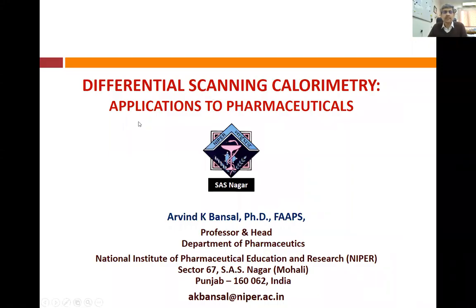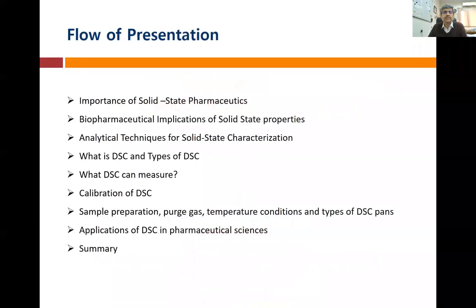Hello everyone. Today I am going to talk to you about a very important technique for solid state characterization called differential scanning calorimetry, in short, which is also called DSC. DSC is one of the most important and common techniques that is used for solid state characterization of pharmaceuticals.